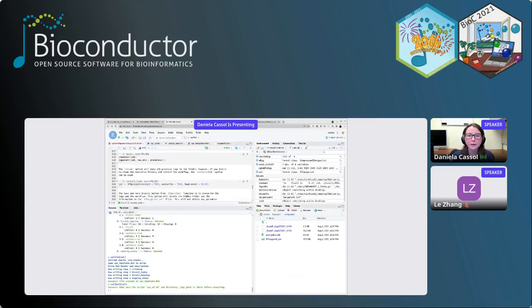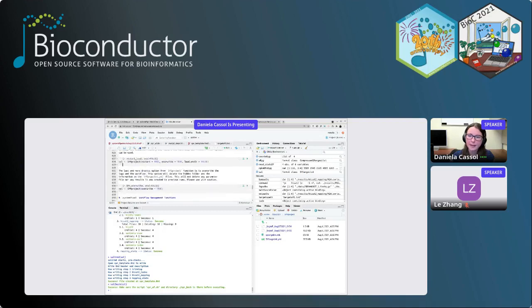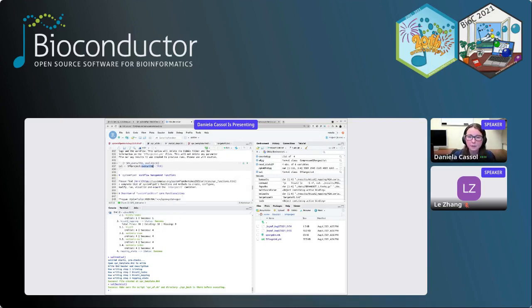And the restart option is a little bit more dramatic because you are deleting all the logs. That gives you the possibility to delete all the logs and just import the workflow. And one more very drastic option is the overwrite. That will delete everything you have in your log and also the database, and start a new fresh object. So yeah, I guess that was it.